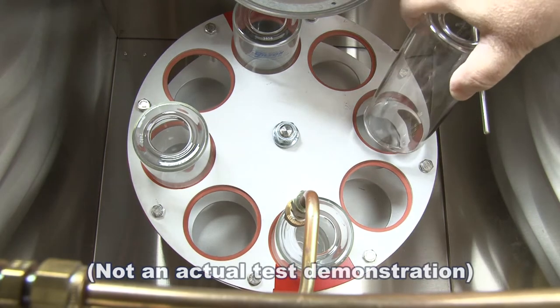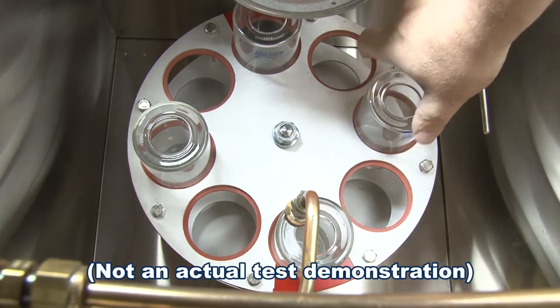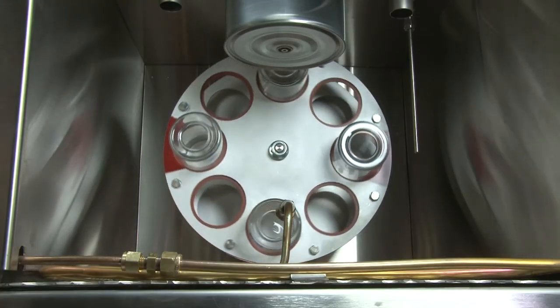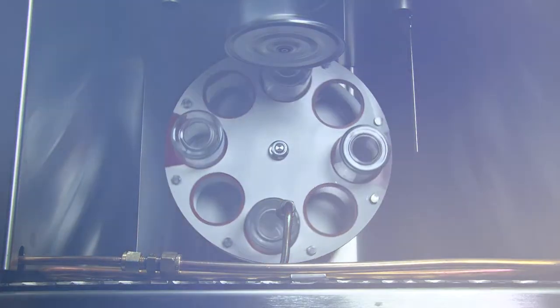All Gilson RTFO ovens are completely checked and tested before shipment. Follow general installation instructions before beginning a test.